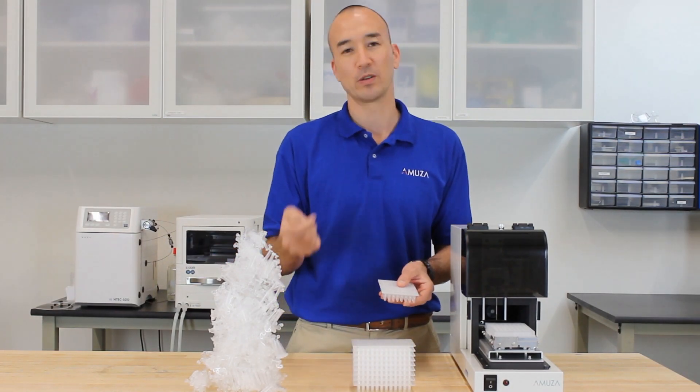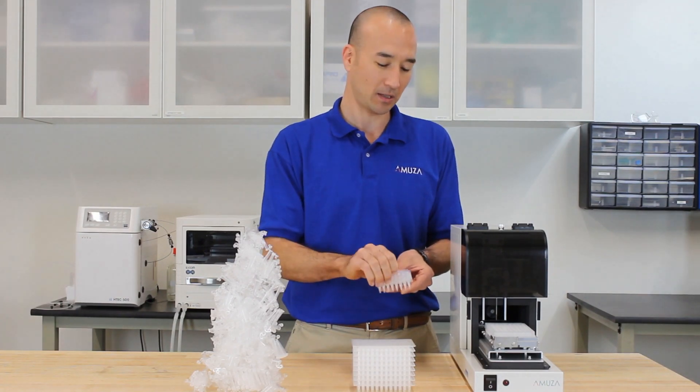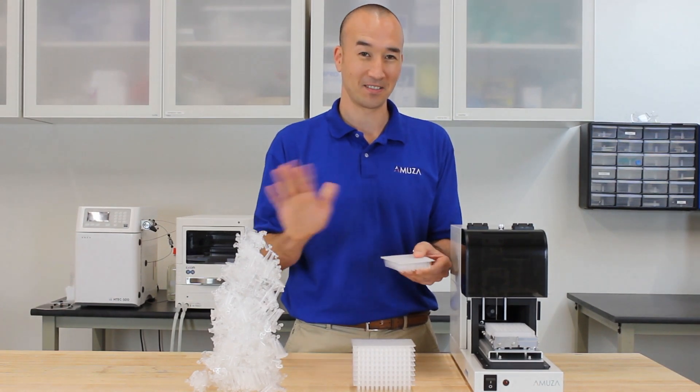And thirdly, you're probably familiar with opening and closing your individual vials. With a 96-well plate, you pretty much take your plate seal, you seal it up, and again, done.